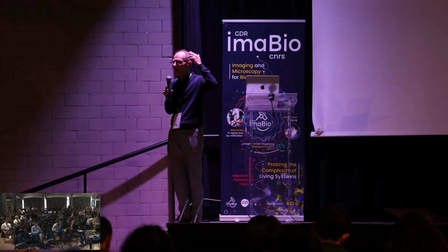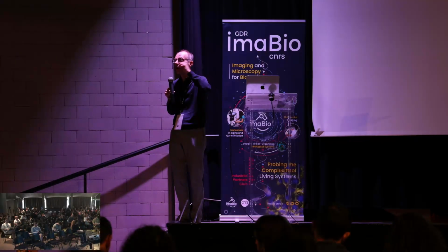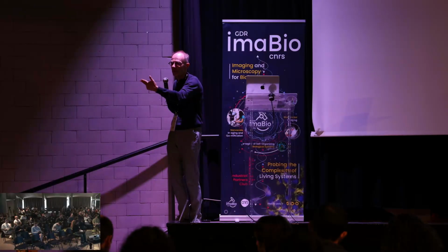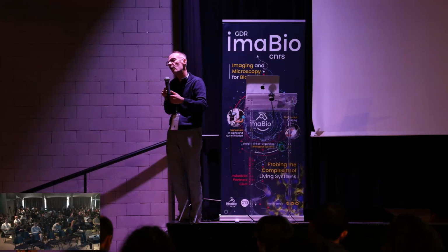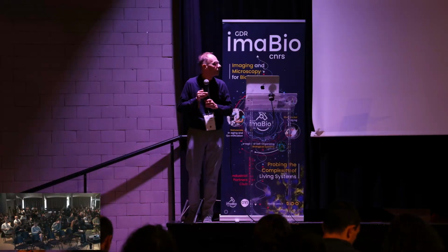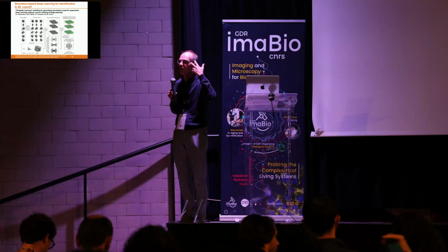But if you know a priori how many macromolecules of one type you have in the tomogram, you can supply this information. If you have 10% ribosomes, or only one RNA polymerase, maybe you can impose a given proportion.